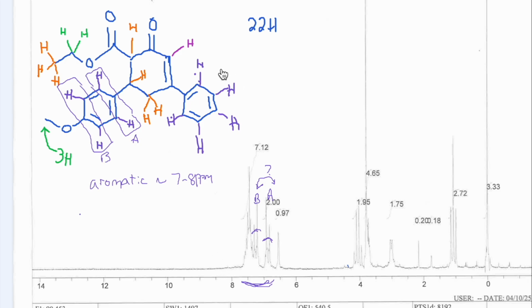This benzene ring over here, we have more complex splitting, and since there's not a lot of electron withdrawing groups or electron donating groups on the ring, they're all going to be in a similar area. So we have multiplets on top of each other. This one over here should be a doublet because of the neighbor. This one over here is split by this and by that, so it should be a doublet of doublets. This one over here should at least be a triplet because of the two neighbors here. So we have some complex splitting, and it's all on top of each other.